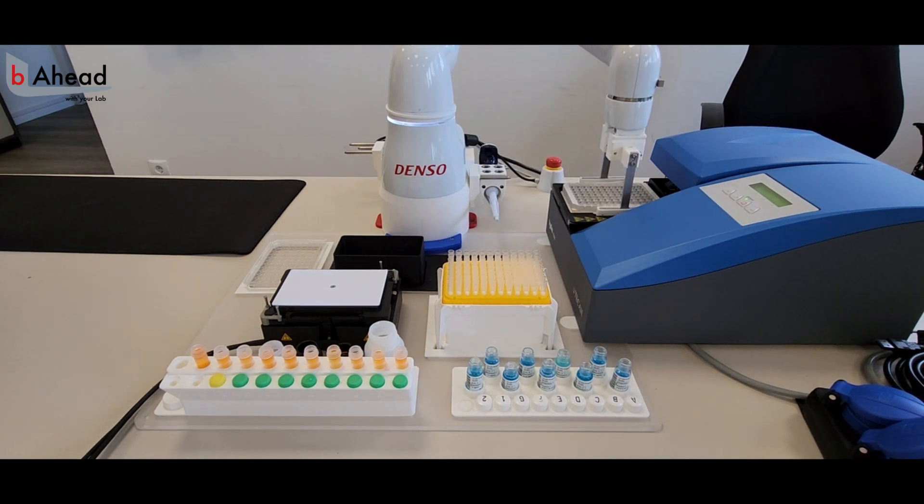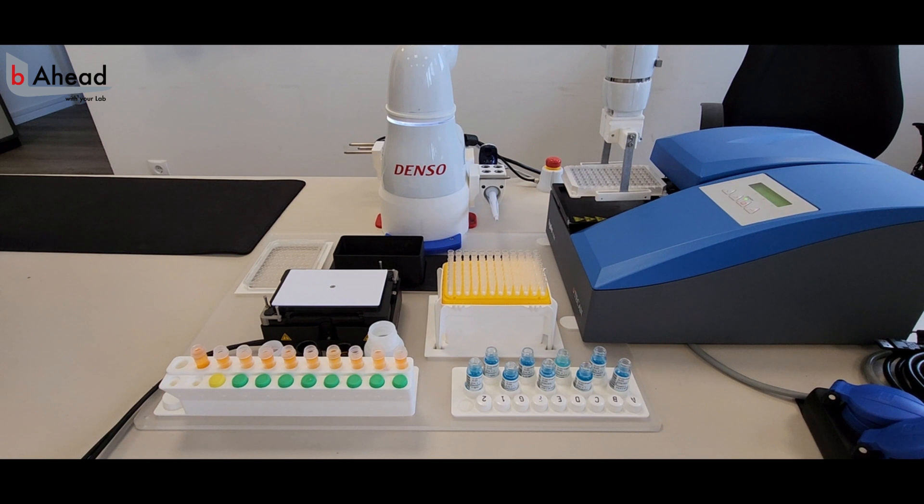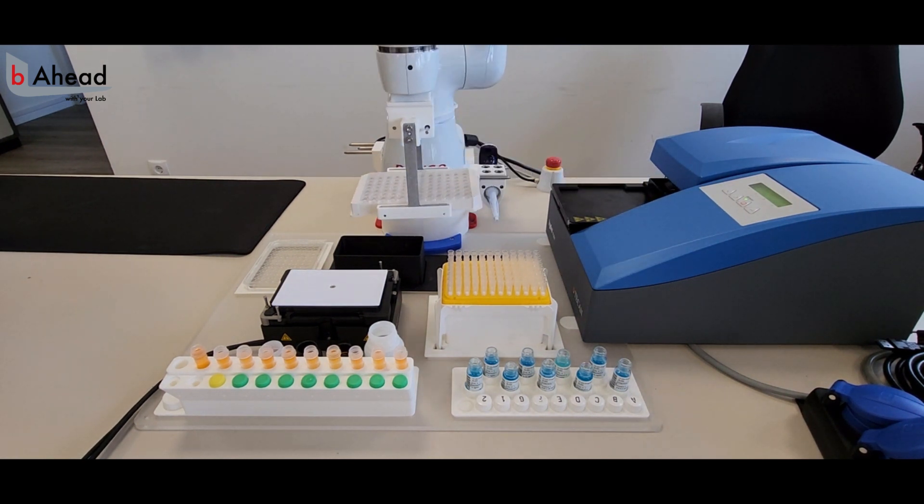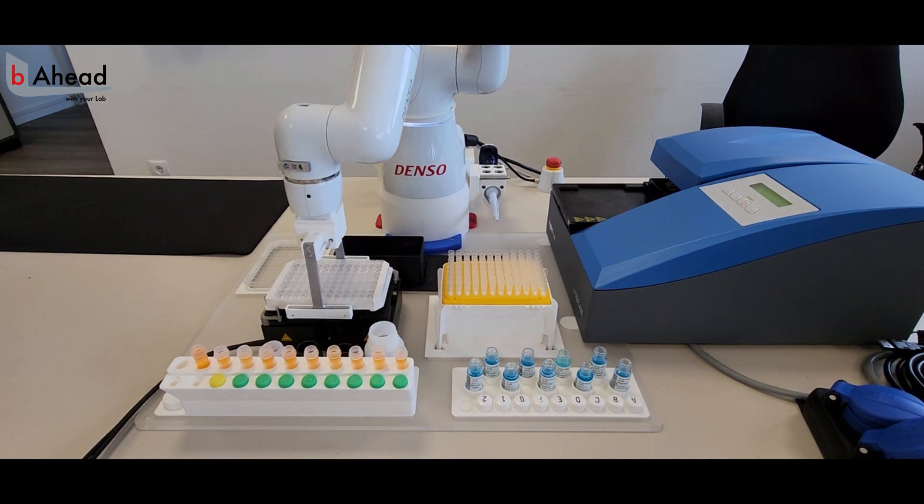After washing is completed, the second pipetting block can start. The microplate gets taken out of the washer and is placed back onto the mixer before buddy switches back to the pipette.